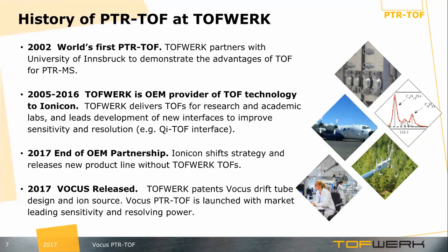Tofwerk served as an OEM provider of TOF technology, and focused mostly on developments of new interfaces to improve the sensitivity and resolution of PTR-TOF instruments. For example, the quadrupole interface TOF was developed at Tofwerk.